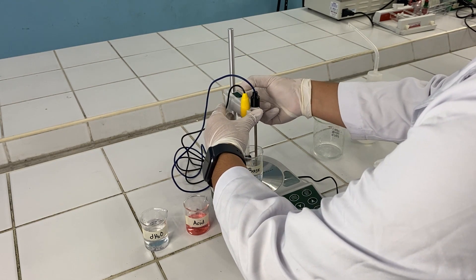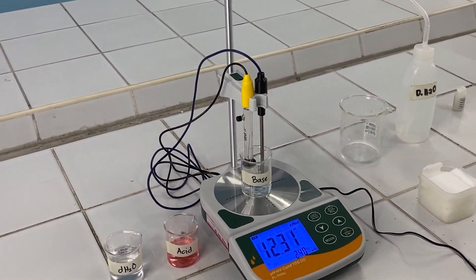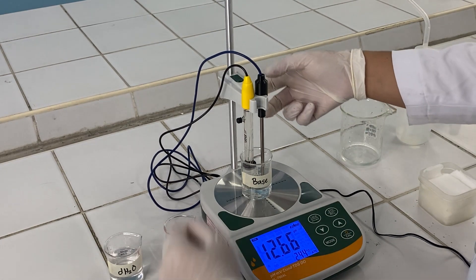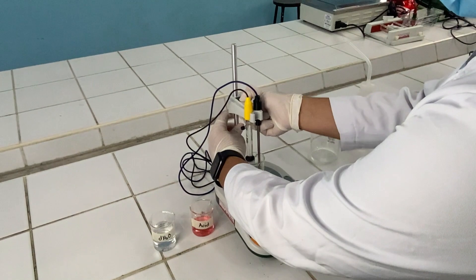Next is to descend the electrodes, allowing the bulb to be submerged under the solution. Wait for the pH meter to read the solution until the number is stabilized. Once the pH meter has stabilized its reading, you can then record the indicated pH.